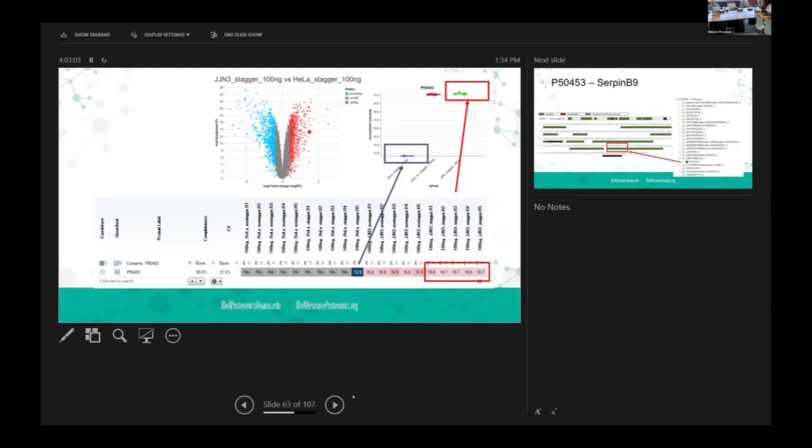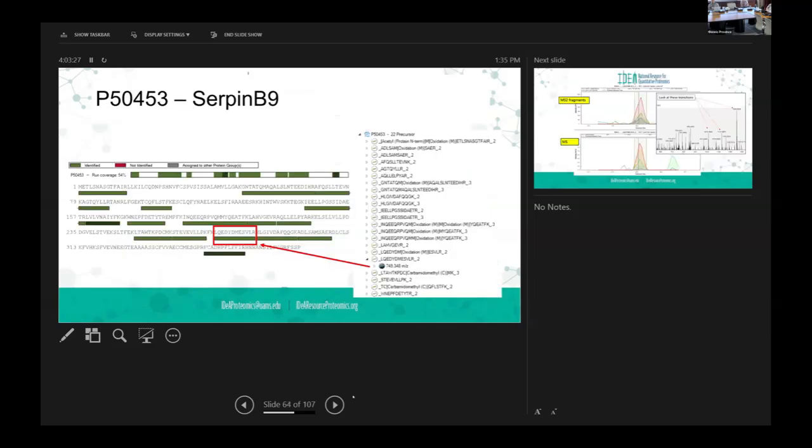But this picture over here is what a lot of people base their biology on. I've got these little red dots up here that all are grouped together. So I've got small variation within the group, but then I've got a large distance between the 2 groups, and that's great. But there's more information there that we need to be able to make that decision.